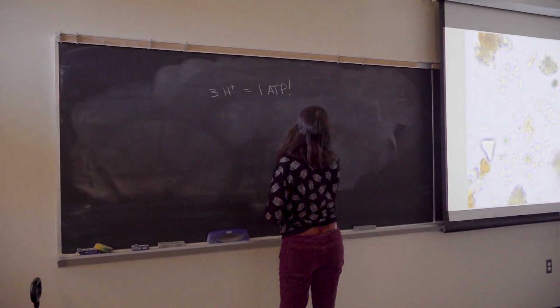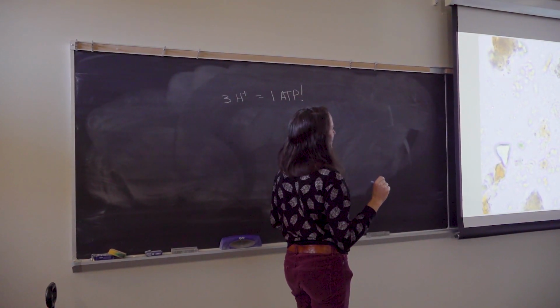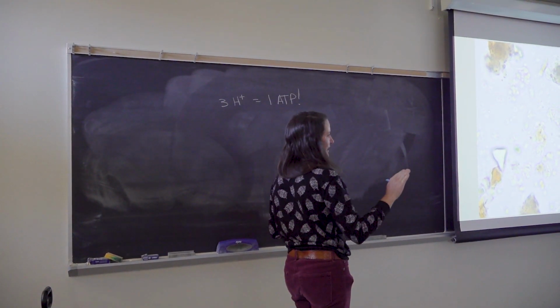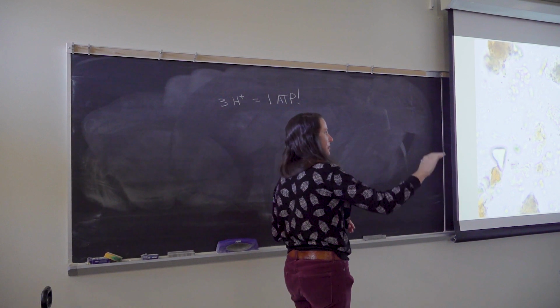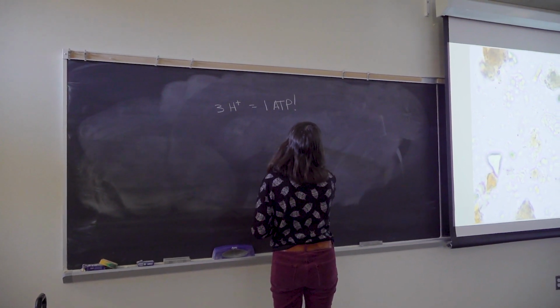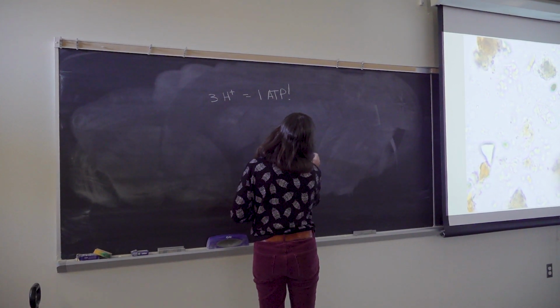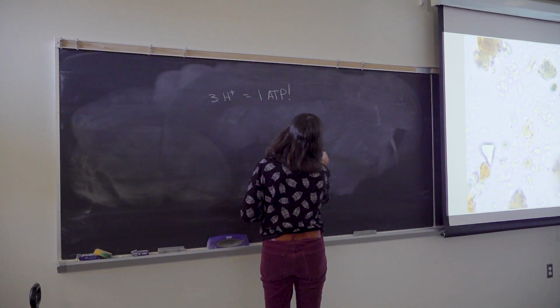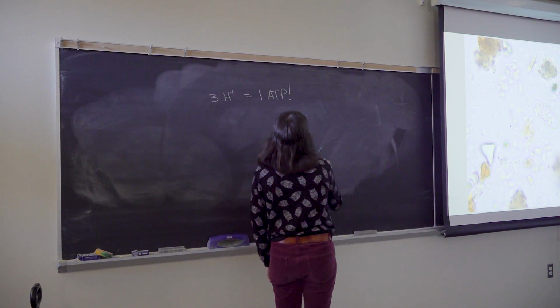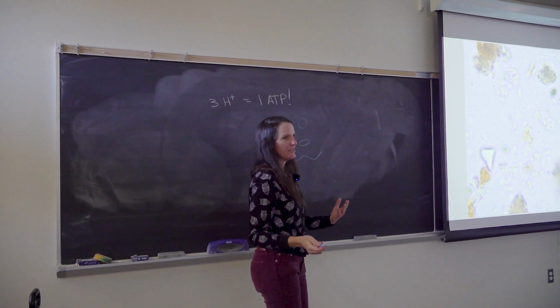But you're going to see different types of bacteria. Bacteria are going to be really hard for me to zoom in on in this particular environment because we're translating that image from the microscope to the computer to the projector and up onto the screen. But bacteria are going to have lots of different shapes to them. These different shapes are going to indicate if they are pathogens or if they're beneficial. So round, rods, filamentous are typically good guy bacteria.